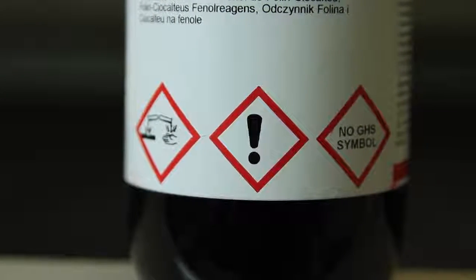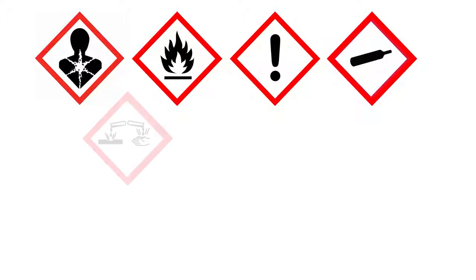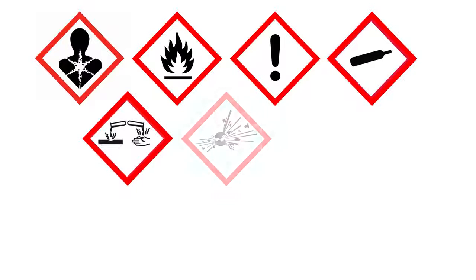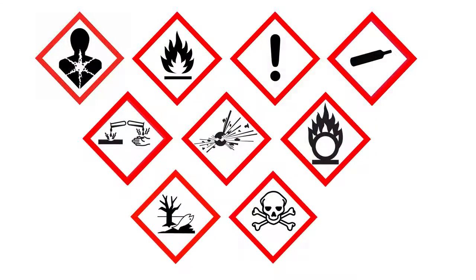Each pictogram represents a specific hazard. Health, flammability, toxicity, compressed gases, skin and eye protection, unstable explosives, oxidizers. An oxidizer is a chemical that initiates combustion through the release of oxygen. Environmental hazards and acute toxicity.